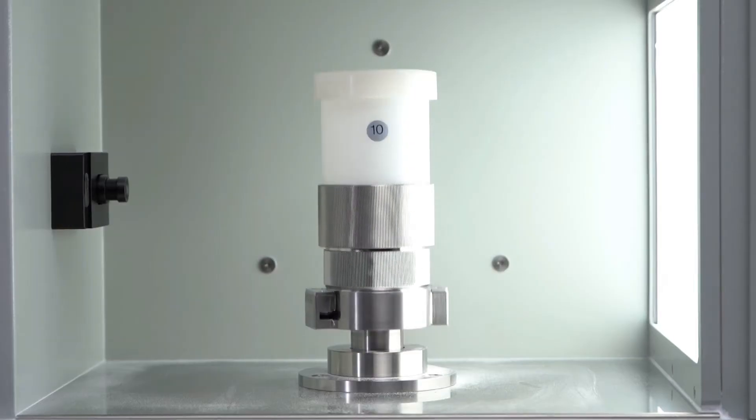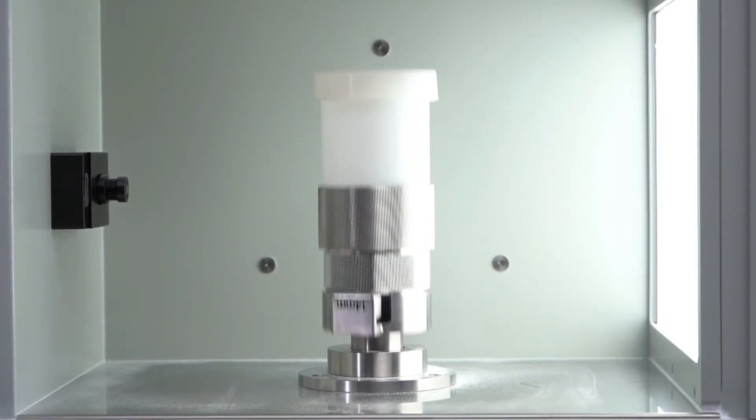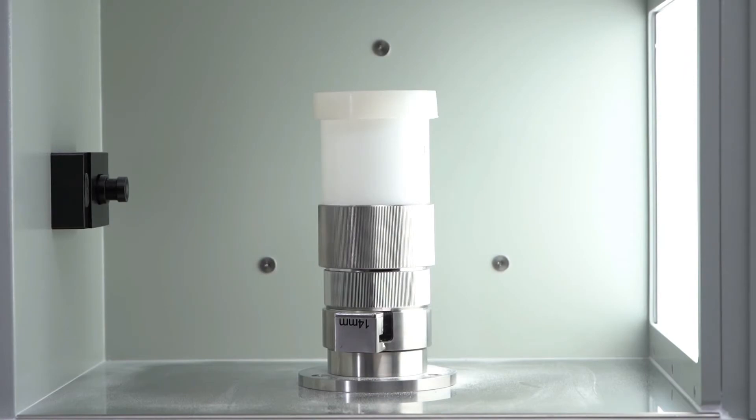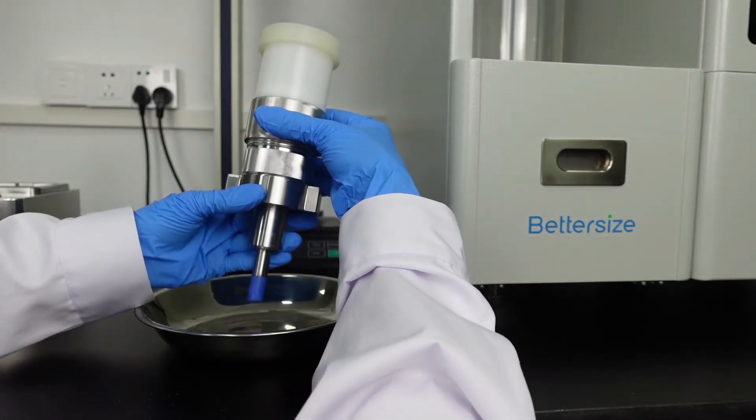Click Start Vibrate to start vibrating and stop vibrating when the preset vibration times reach. Take out the tap density assembly.